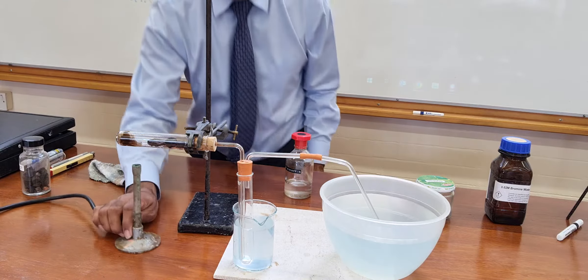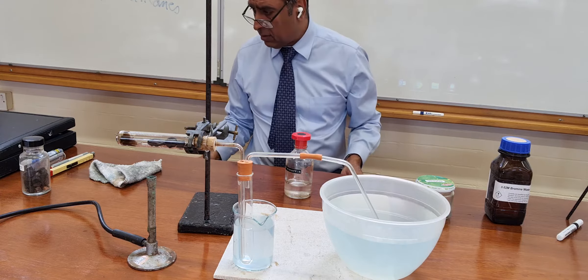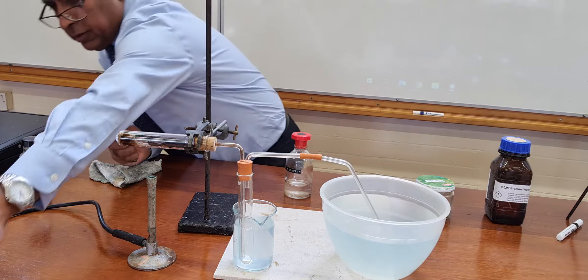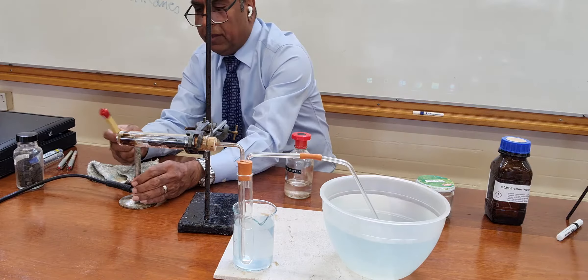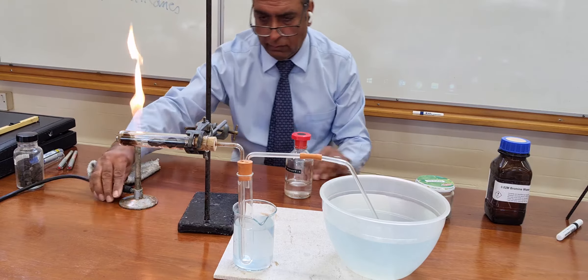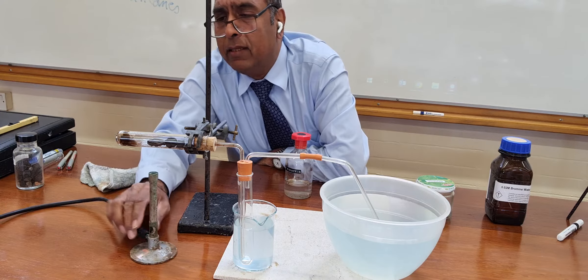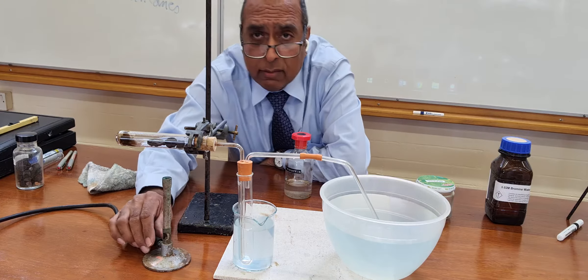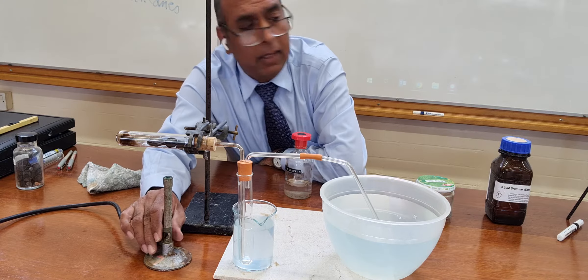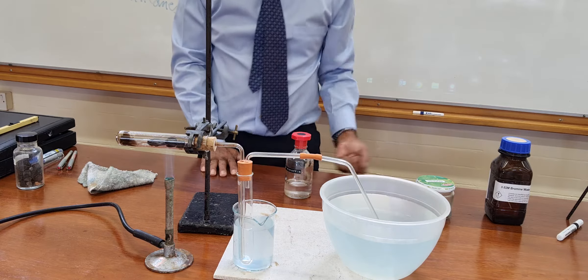I'm going to heat this end. The key to this is to get the porous pot really really hot. I might even get two Bunsen burners on it, and when it's hot then we should start to see something happen.